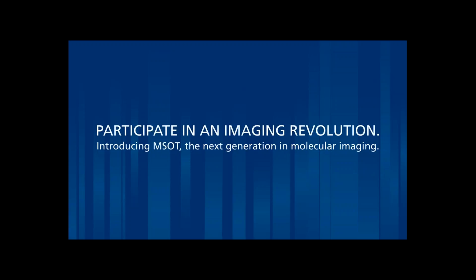Okay, maybe one more question, going a little bit into the future. Can people do imaging on dogs or rabbits, or if not now, is it possible in the near future? Yeah, I'll take that one as well. This is certainly possible, not in the context of our preclinical scanning, as that's just not the geometry that we set up. However, with the handheld system, it doesn't matter if you're imaging a mouse, a rat, gerbil, cat, dog, pig, or human. This can be possible regardless of the specimen. So it's certainly within the range of possibilities.